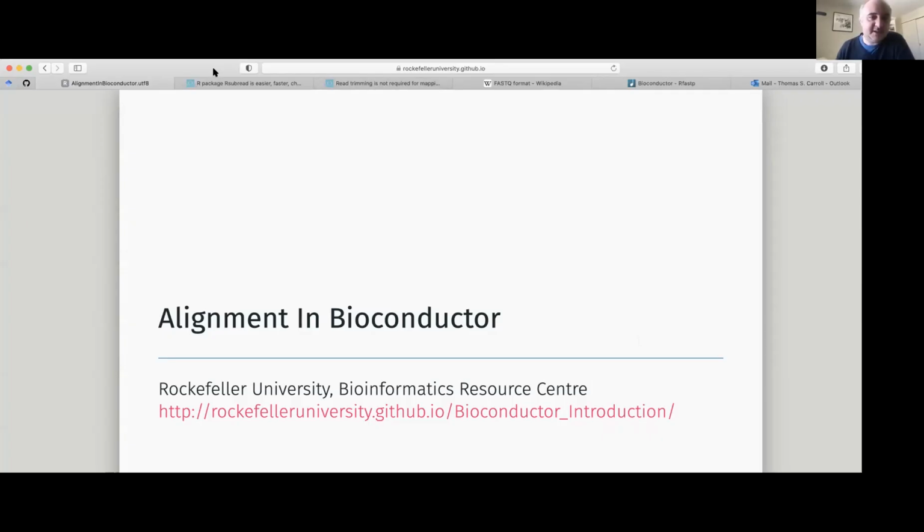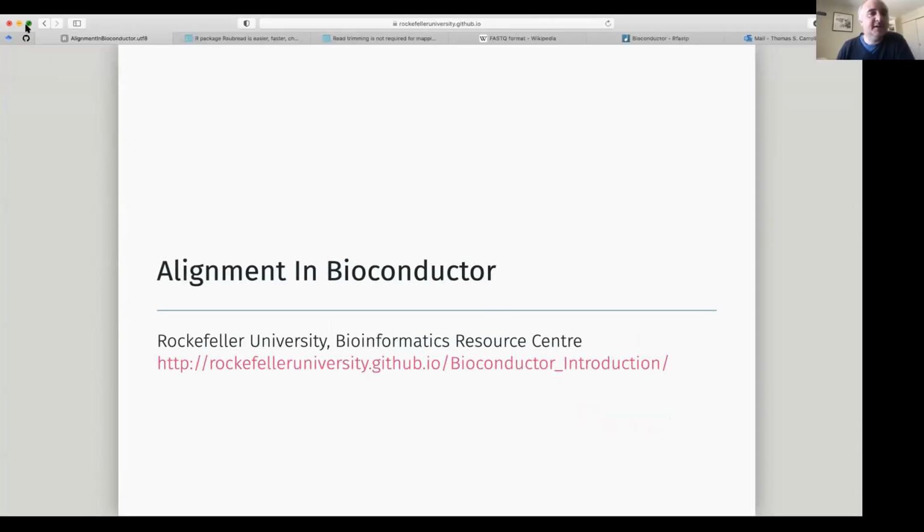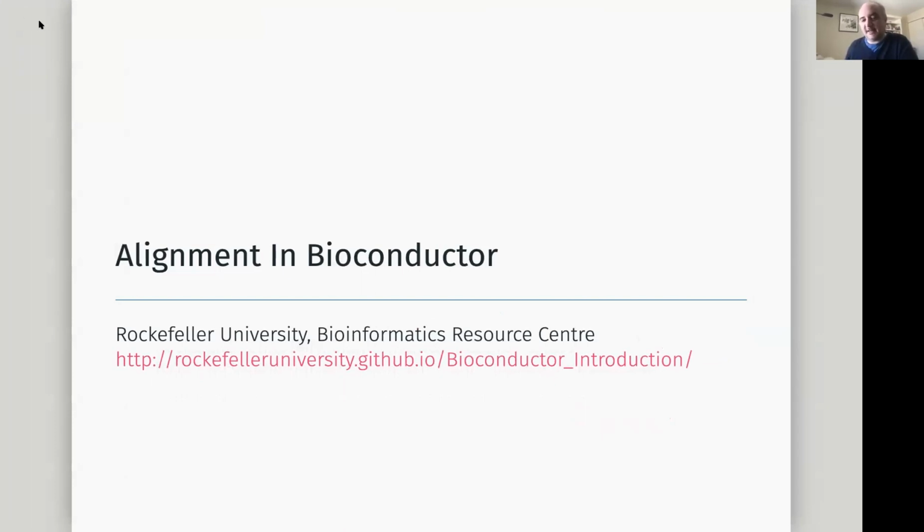Great. So our next session, we've just looked at FASTQs, and we're now going to see how we can turn this into something we can visualize in our linear genome browser. We can start to look at it in context of other genomic features. So it's this that we're really going to turn our FASTQ into, something more applicable to our analysis, right? Something we can use and visualize.